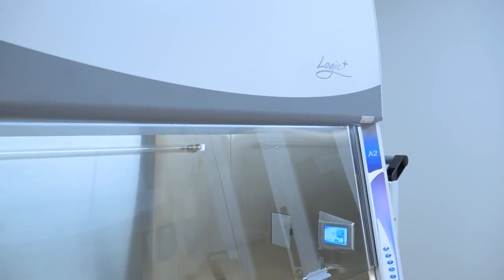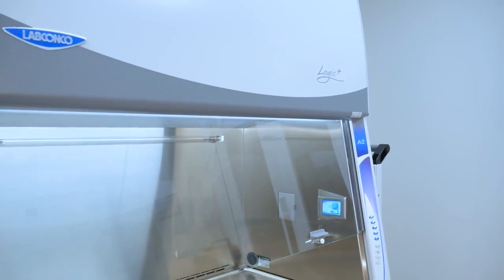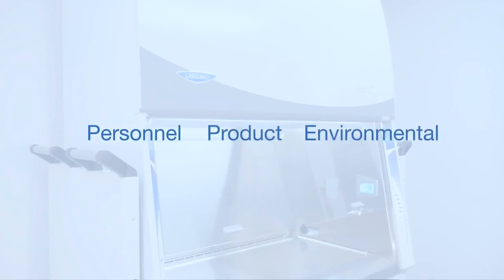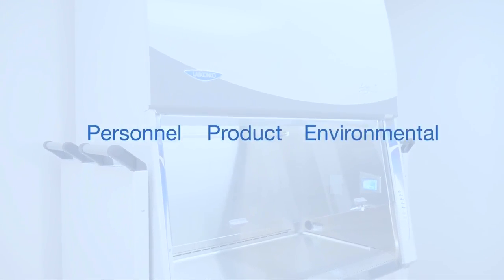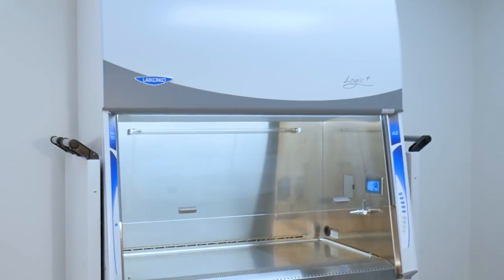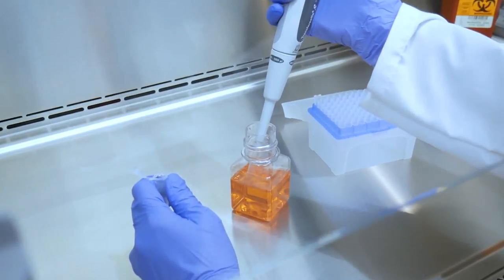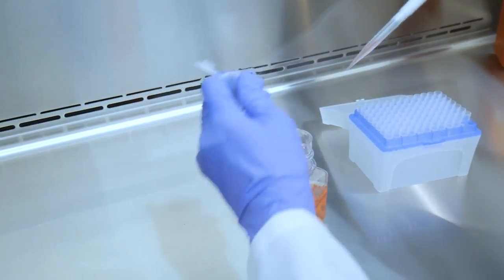A Class II Biosafety Cabinet, or BSC, is an important engineering control that provides personnel, product, and environmental protection when working with biohazardous materials. When used properly, a BSC will allow for safe work in a contamination-free environment.